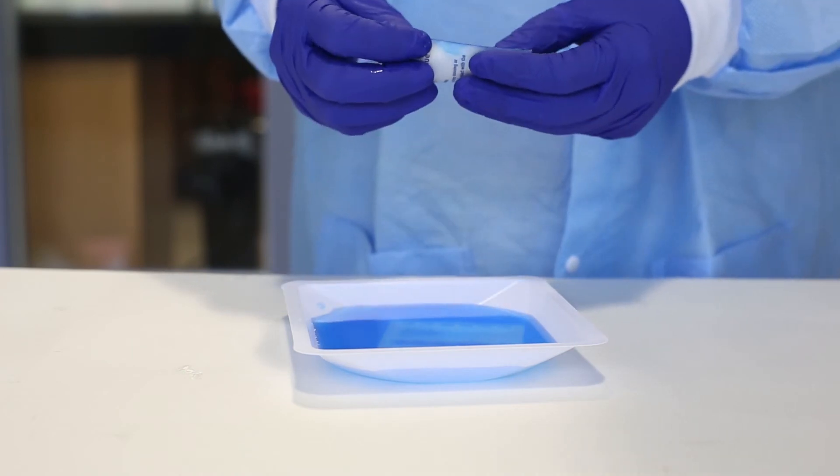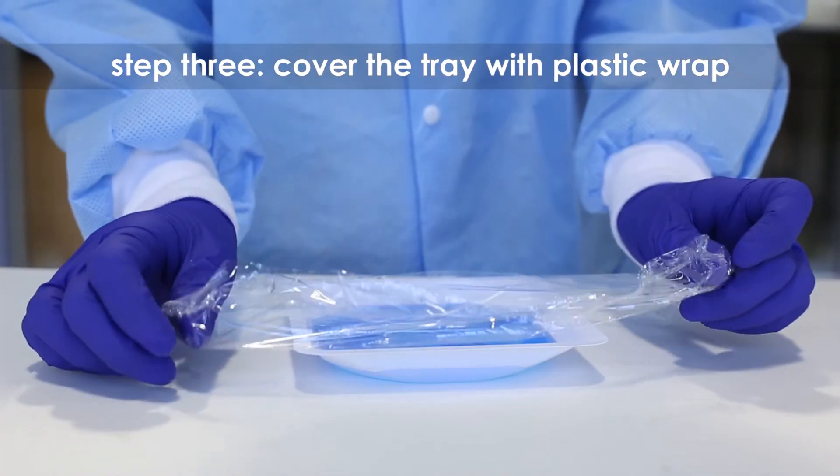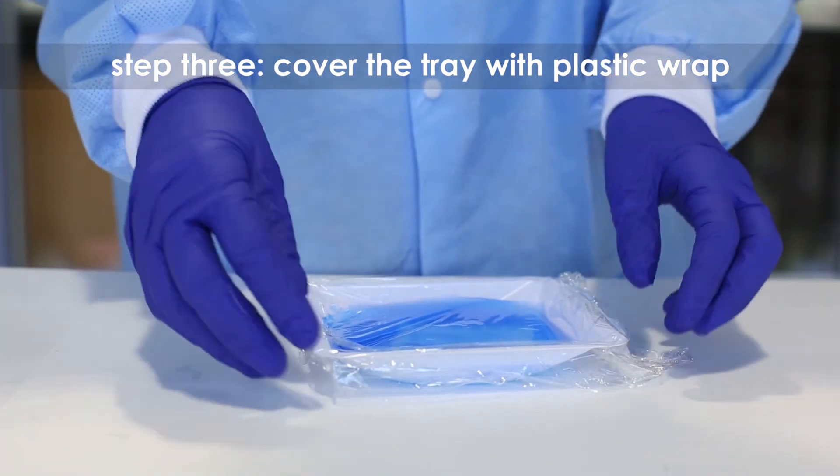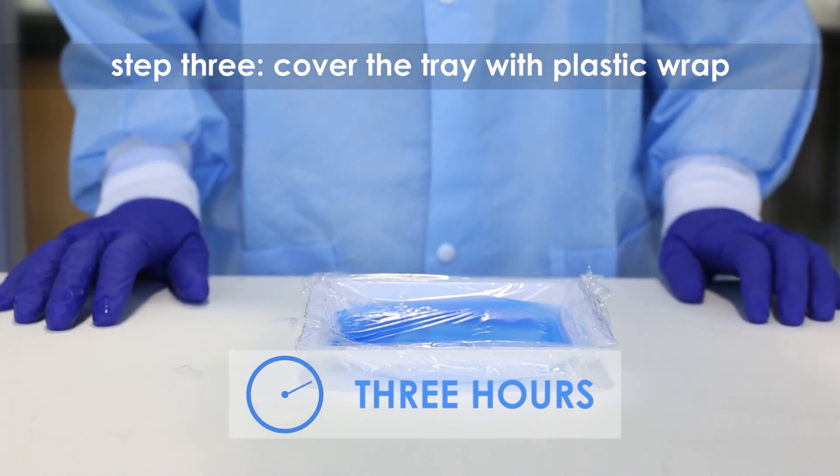Step 3: Cover the tray with plastic wrap to prevent evaporation and soak the gel in the staining liquid for at least three hours. The gel can remain in the liquid overnight if necessary.